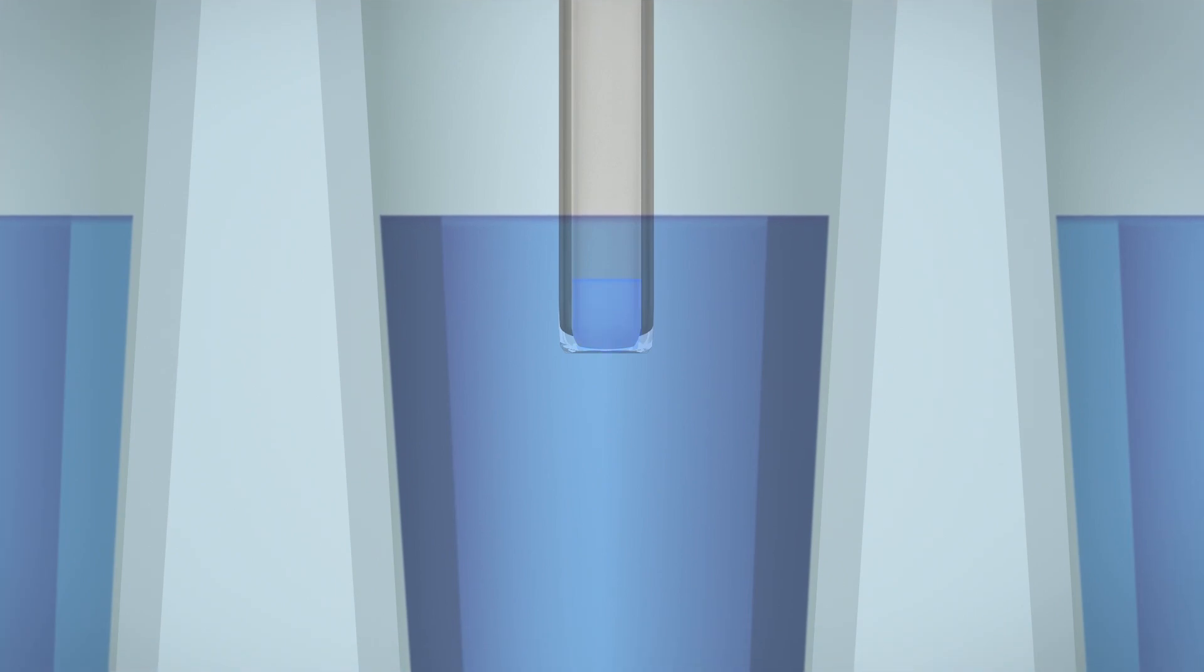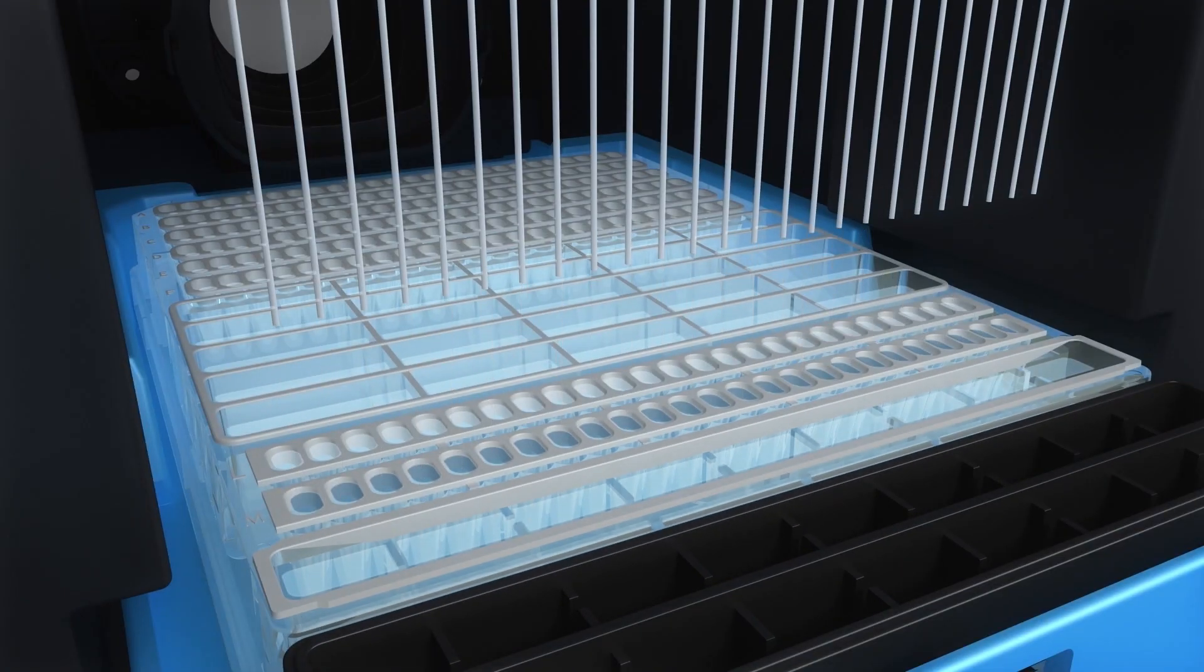Simple Western begins by aspirating the separation matrix and then stacking the matrix into each capillary.